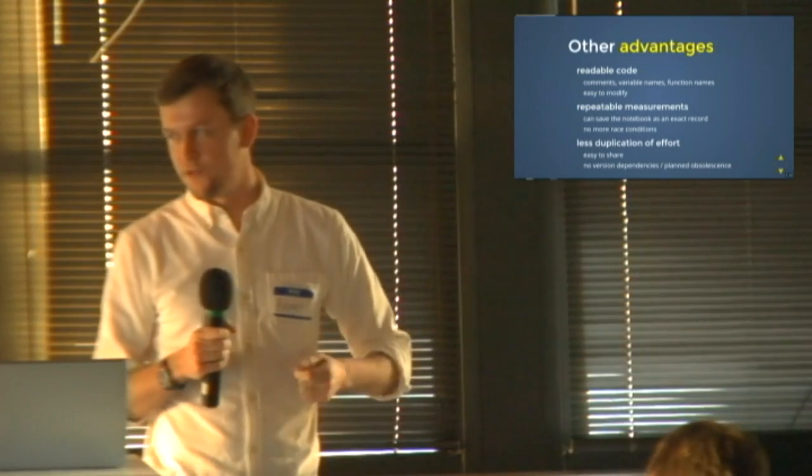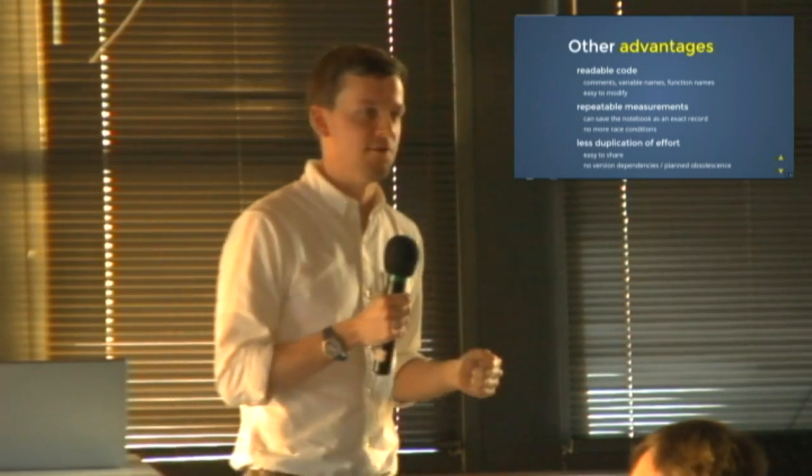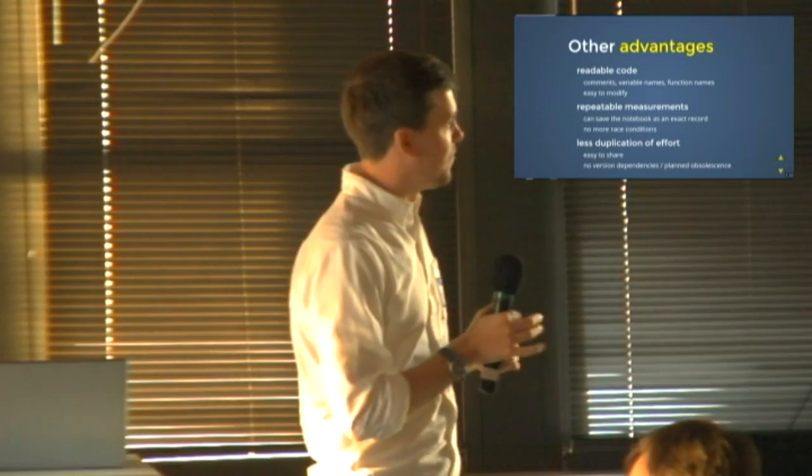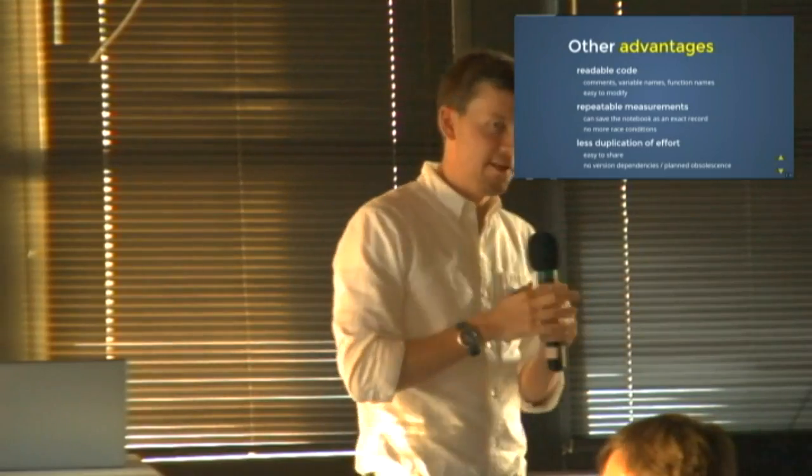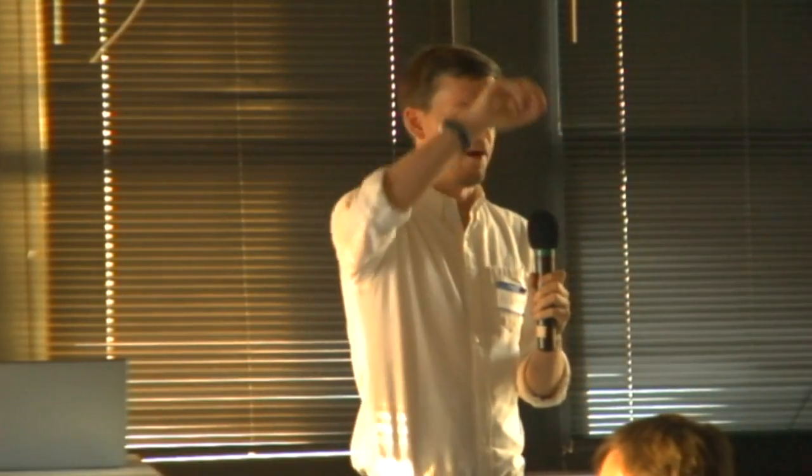One other thing, this isn't so much notebooks are great as LabVIEW is terrible, but the way you do variable assignment in LabVIEW is you run a little wire to a box, and it's really easy to end up with a situation where you run a wire to a variable box up here, and you read from that same variable box somewhere else and get yourself a nice little race condition. So even individual measurements, let alone the whole experiment, are much more repeatable with this Python setup.